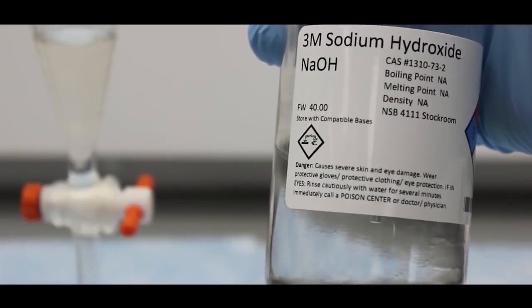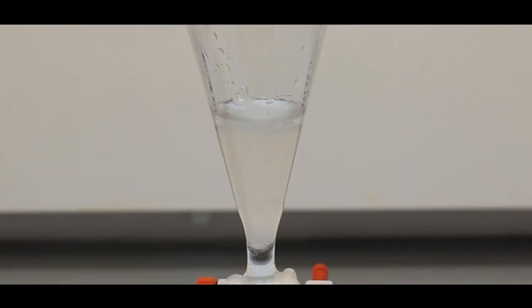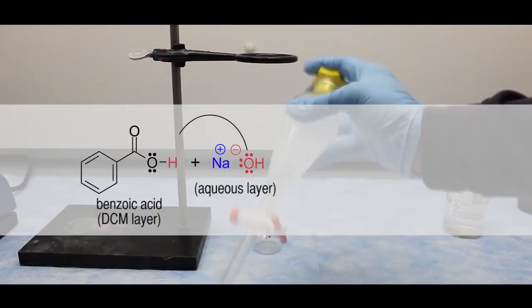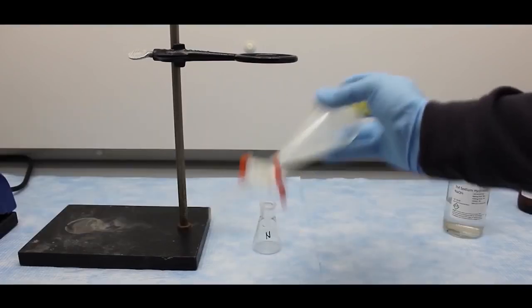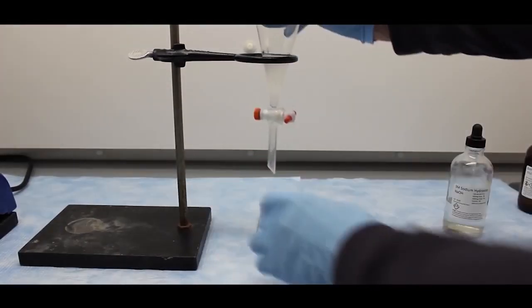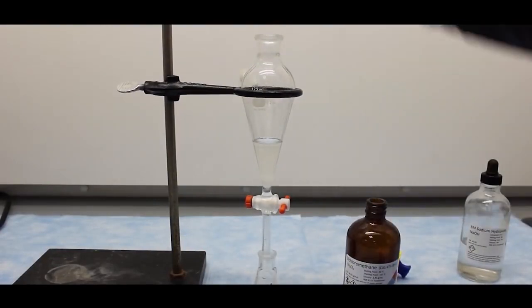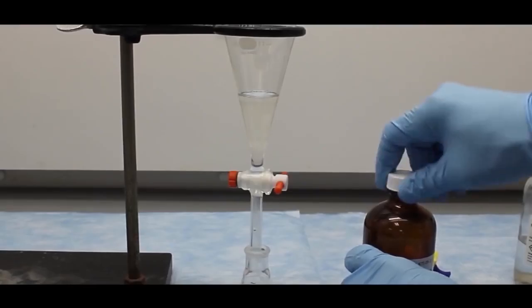To remove the benzoic acid, I will add approximately 5 milliliters of 3 molar sodium hydroxide. I will shake the sep funnel to facilitate the deprotonation of benzoic acid by sodium hydroxide, forming ionic sodium benzoate, which will migrate to the aqueous layer. And as before, just to be safe, I will add a few drops of DCM. The DCM, as expected, is the bottom layer.